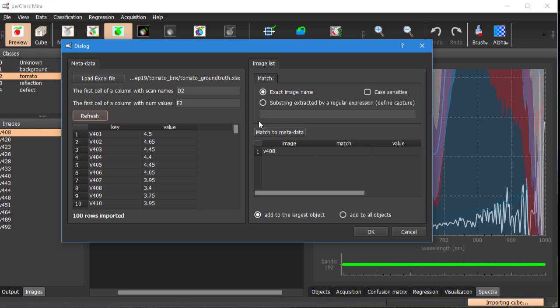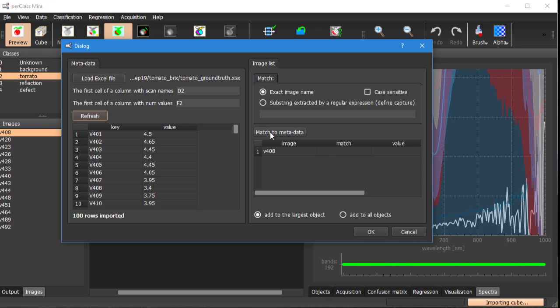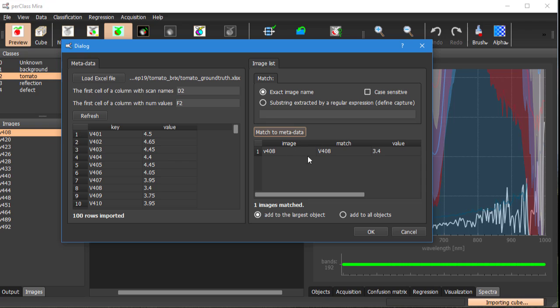The second part of the dialog is dealing with matching of the images we have in per class mira project into this excel metadata. The simplest matching is exact so that means that the excel file contains exactly the same names as the scan names we already have in per class mira. We are in this situation so we can just click to match the metadata and we will get for selected image or images in our project the numerical values.